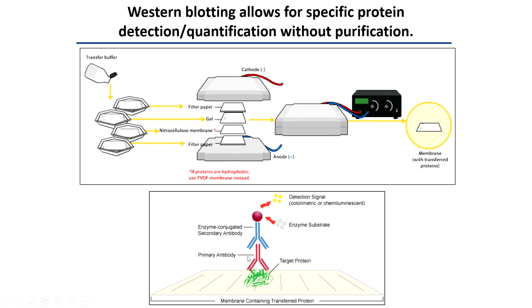These are going to be completely different for every target, and so it's difficult to visualize this because you'd have to come up with a different system for every single antibody ever made, which is just too many. And so what we do is we create a secondary antibody that's capable of binding every type of primary antibody. The primary antibodies bind to their target proteins with specificity only on the forked end, but this long shaft end is the same for every single primary antibody.